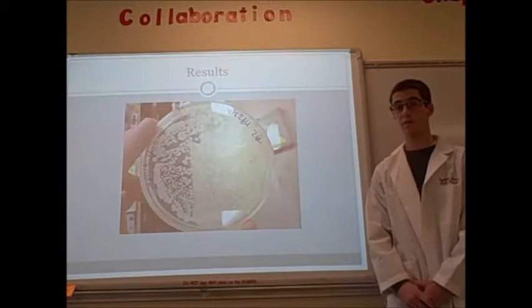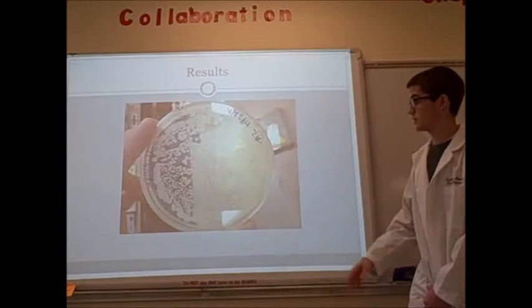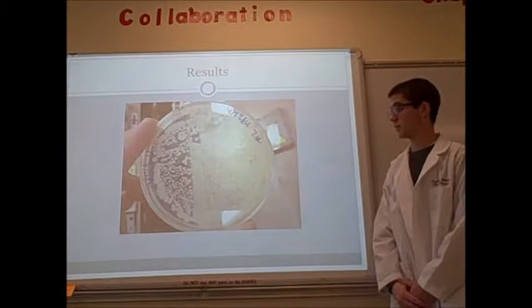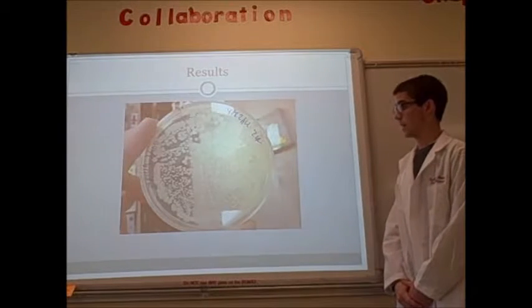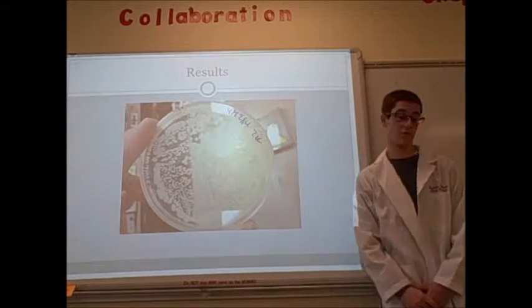This slide depicts the positive pUC19 plate, which is bacteria transformed with pUC19. This plate was diluted down to 1/100th of the initial dilution, or the initial transformants. As you can see, there are definite colonies, but no blue colonies, indicating a problem with either the IPTG or X-gal solution, and therefore no ability to quantitatively analyze the transformation.